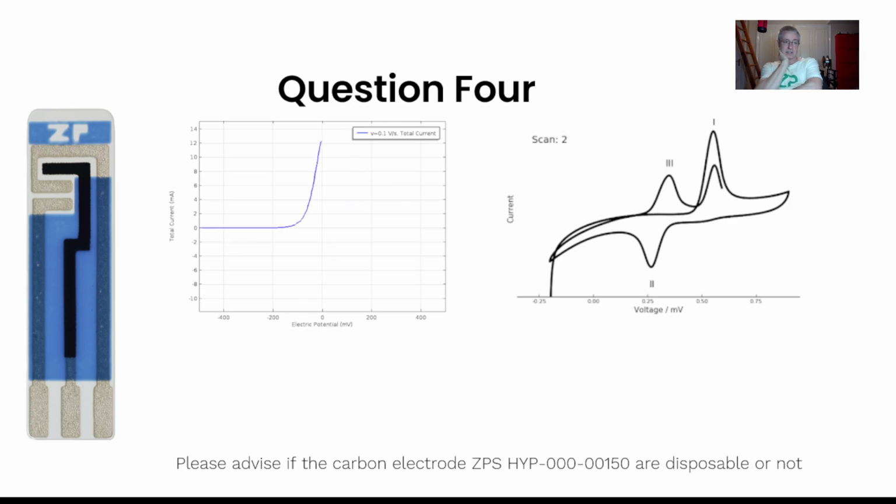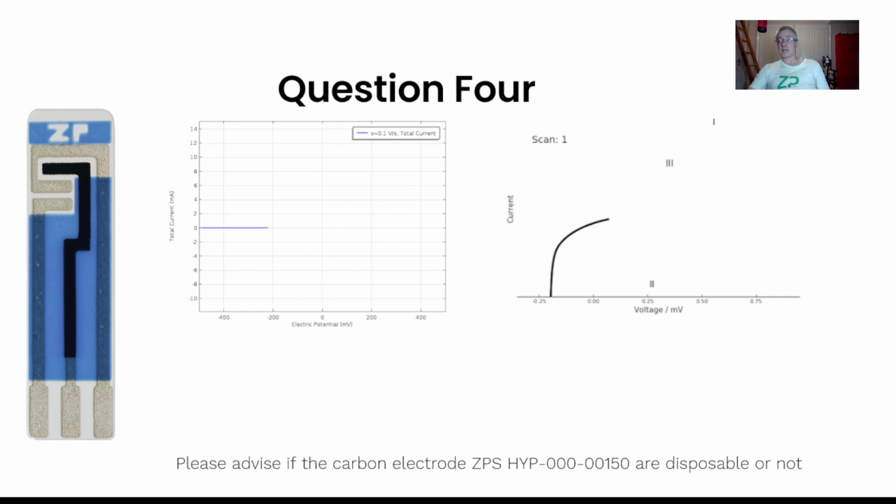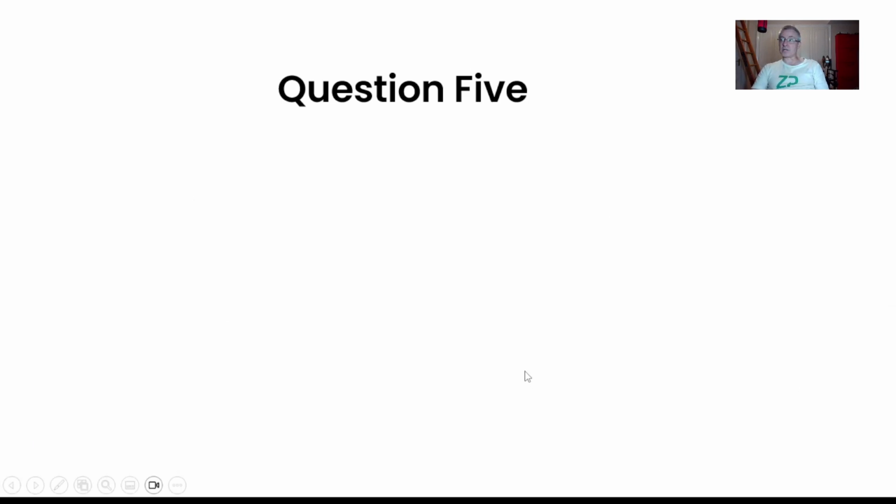If they start, and that's the whole thing about R&D, if they start using molecules that I haven't otherwise envisaged, in this case this particular molecule on the right hand side, the experiment works, but in doing that, the electrode gets modified by the molecule and you can't reuse the electrode. And that's the situation, if I can put it that way.